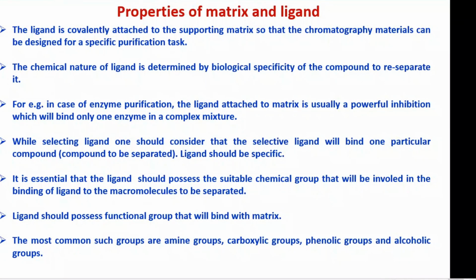So the ligand should also have some other group which can interact with these matrix groups. Then a stable ligand-matrix complex will form.